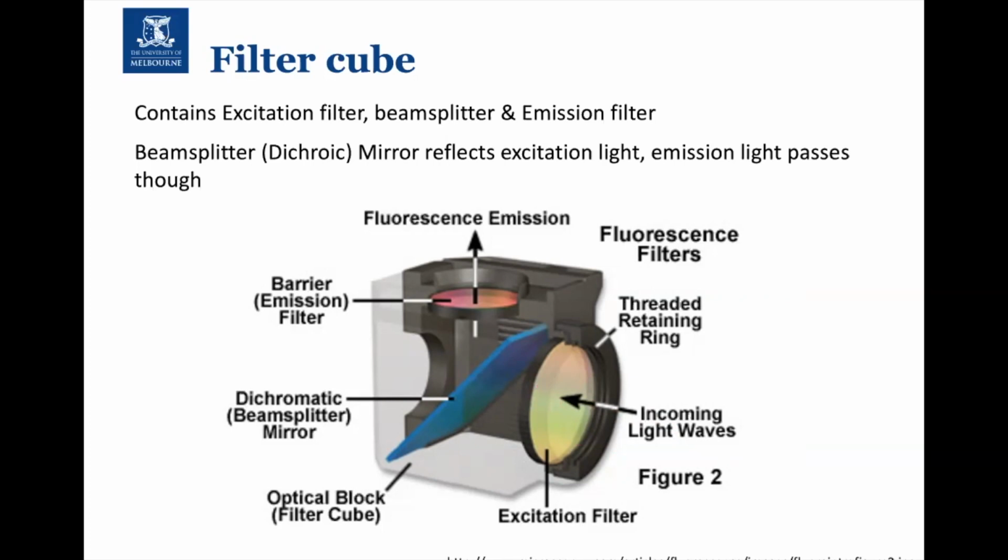And then because of the Stokes shift in fluorescence, remember we're increasing the wavelength of light that we're collecting coming back through the objective. This mirror is specially tuned to allow that longer wavelength to travel through. And then again, we have an emission filter here, which will select the light that's going up to the eyepiece or to the detector.